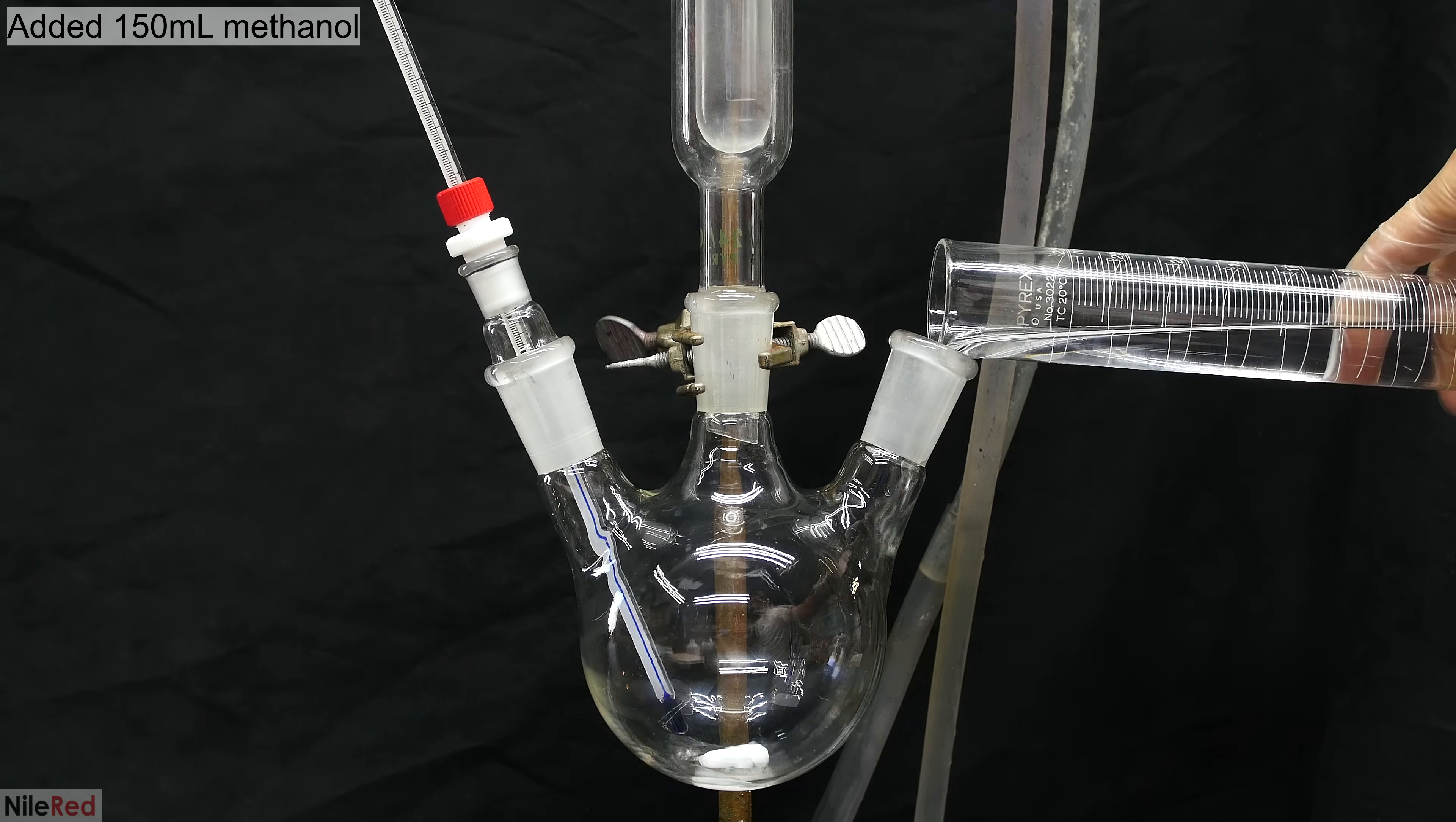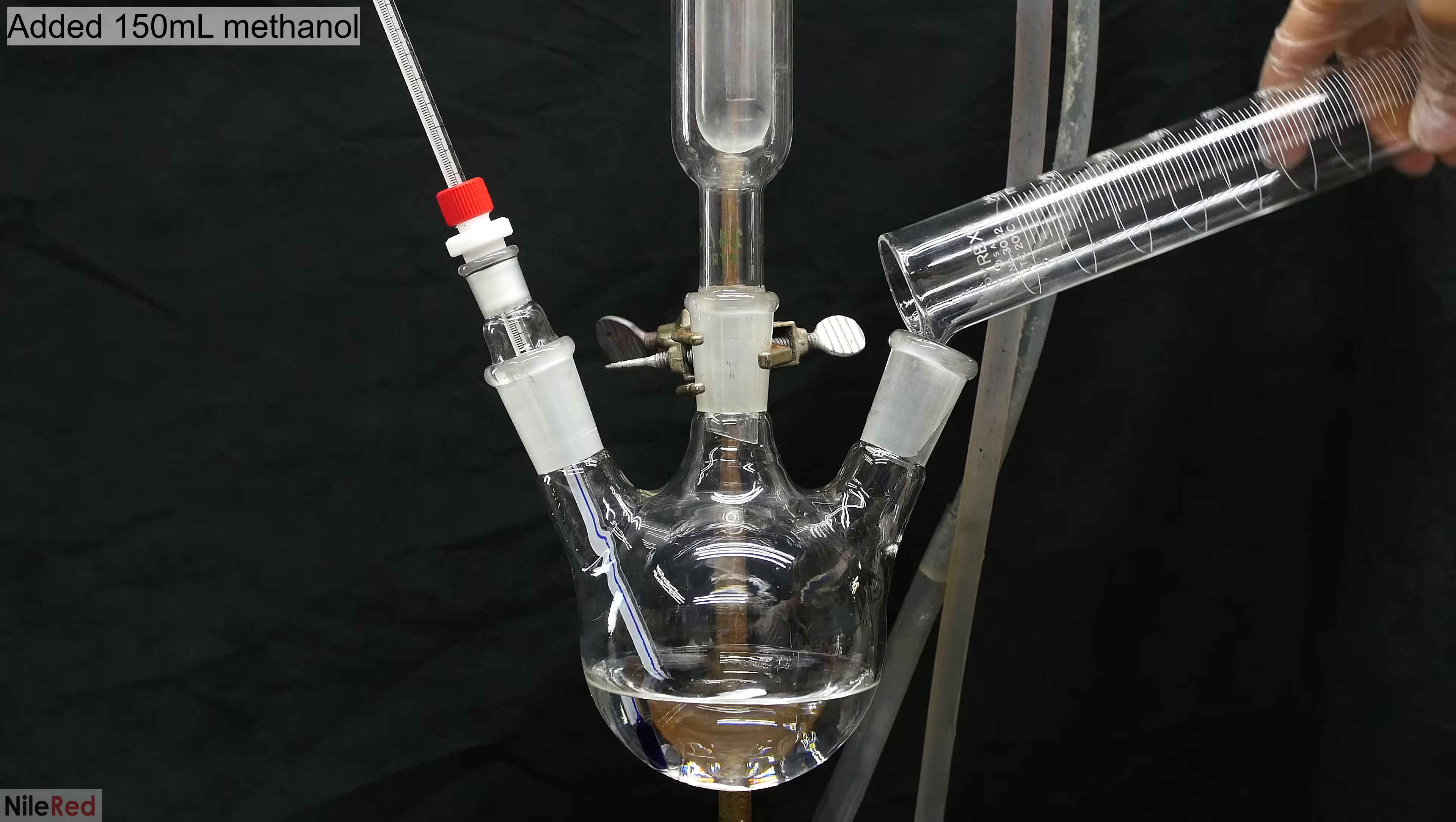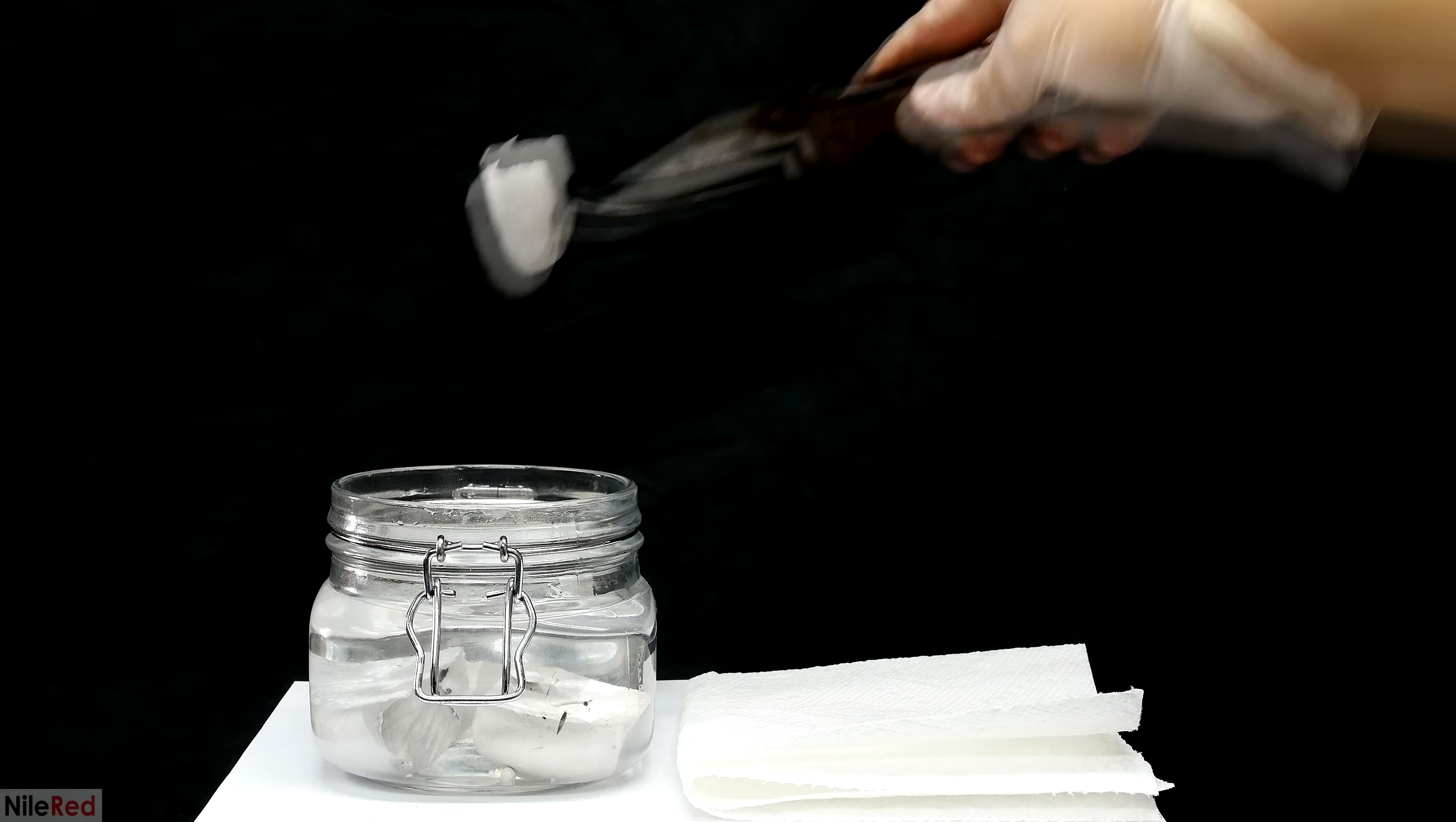To start things off, I added 150 milliliters of dry methanol to a round bottom flask. Once I'm done adding the methanol, I then move on to preparing the sodium metal. Before the sodium metal can be used, we first have to clean off the mineral oil that it was stored in, and then we have to chop it up into smaller pieces.